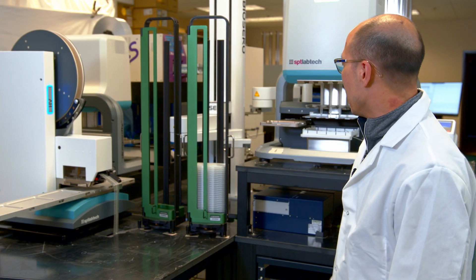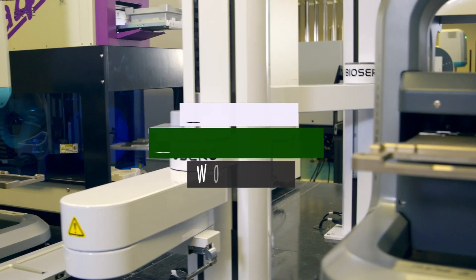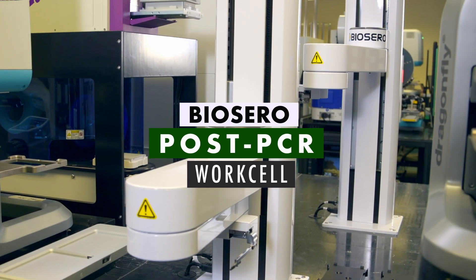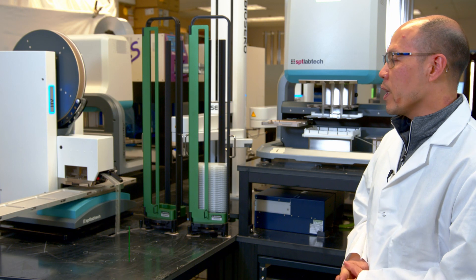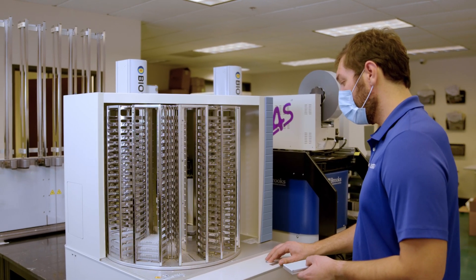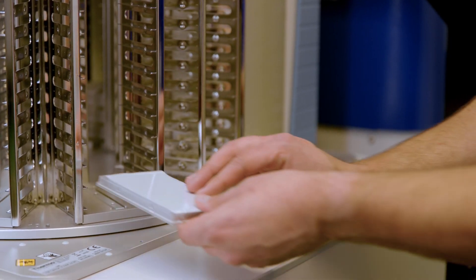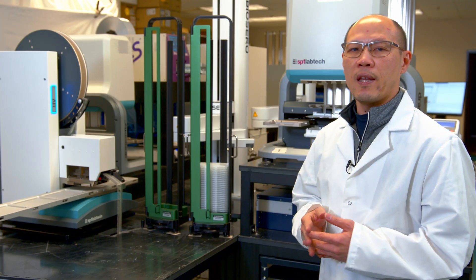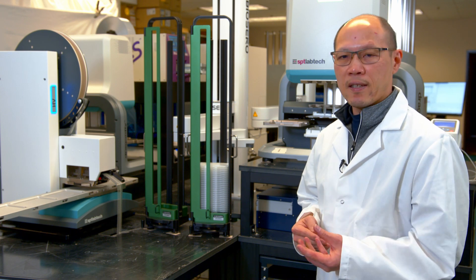This particular system has two arms instead of one because there are extra pieces of instrumentation required in the workflow. What is happening here is a step called tagmentation. The raw DNA molecules that are created from the previous system get cut and diced, but then they get tagged.